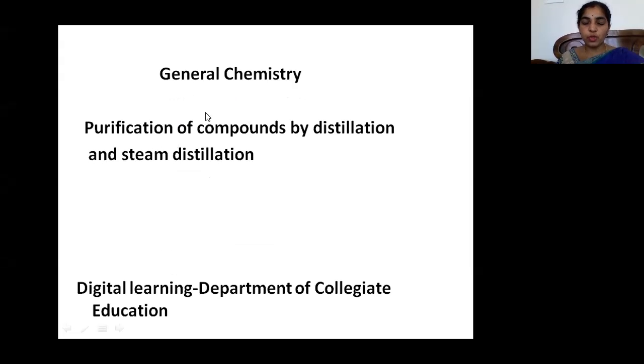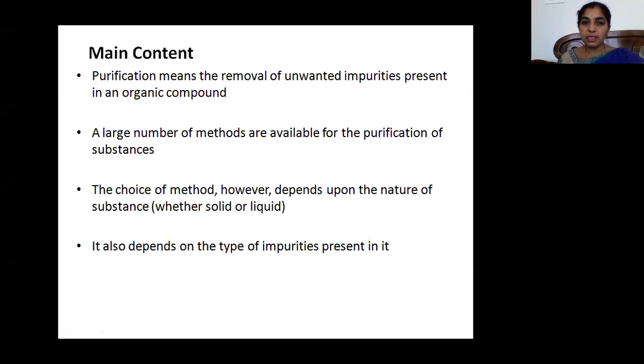The topic I am going to discuss now is purification of organic compounds by distillation and steam distillation. Purification means, as you may already know, the removal of unwanted impurities present in an organic compound, or the isolation or separation of the compound of our interest from other impurities.